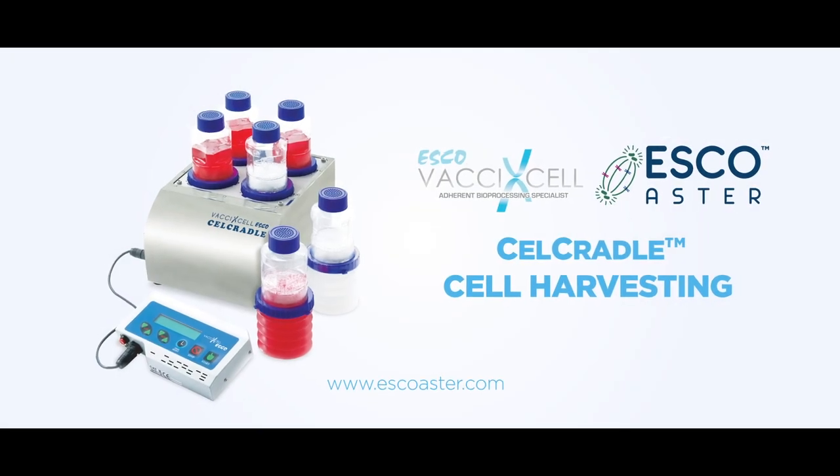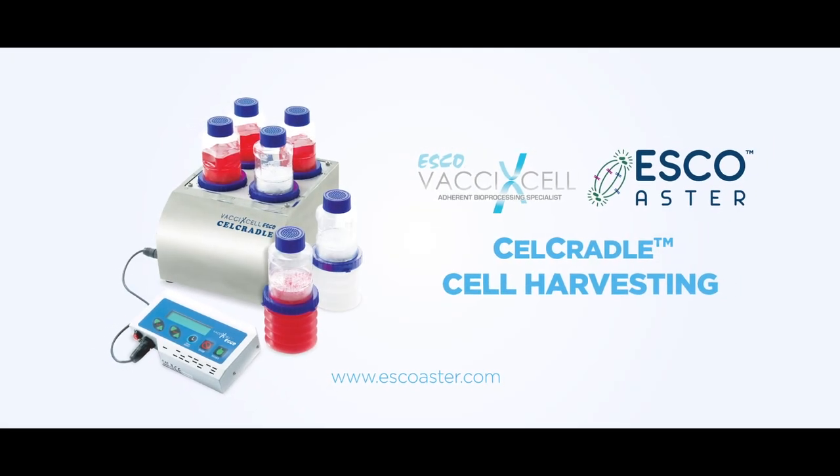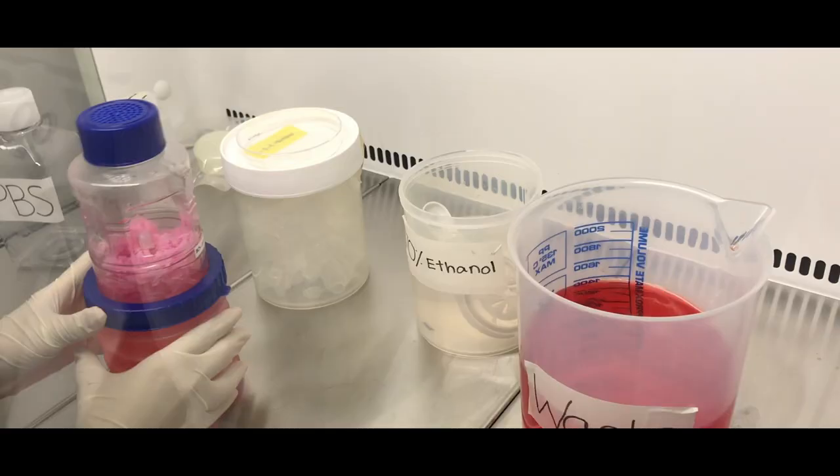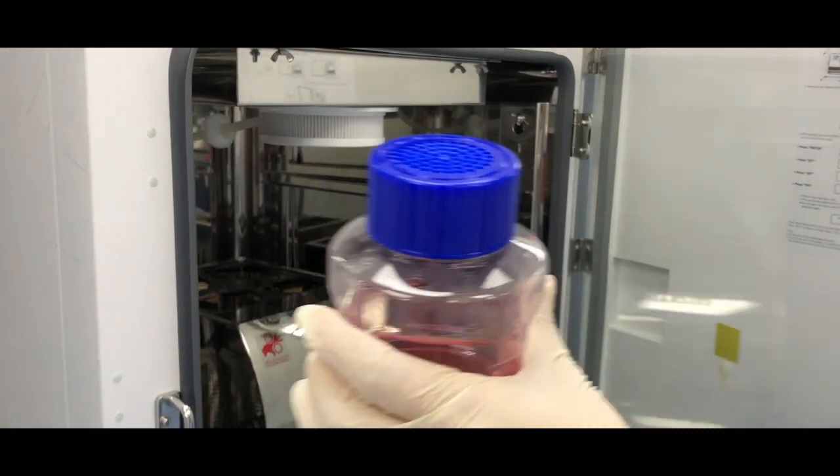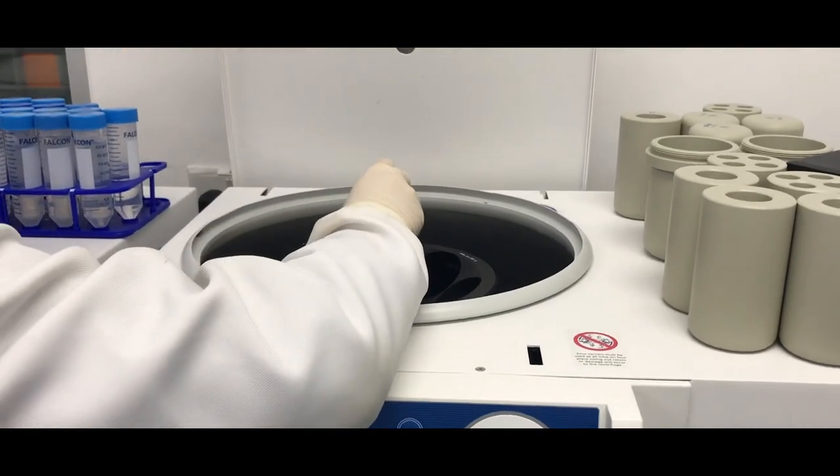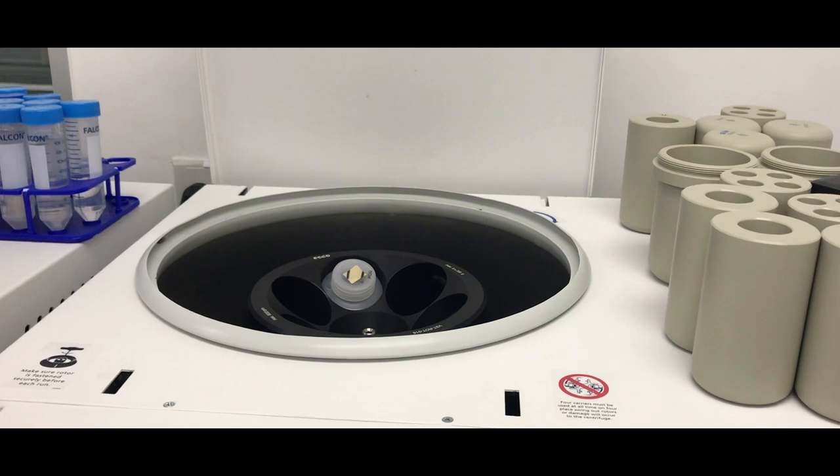This video demonstrates the harvesting process for the cell cradle bottle. Proper cell harvesting method is important to get the maximum cell yield at the end of the culture process. The succeeding video will show how to harvest cells properly from the cell cradle system.